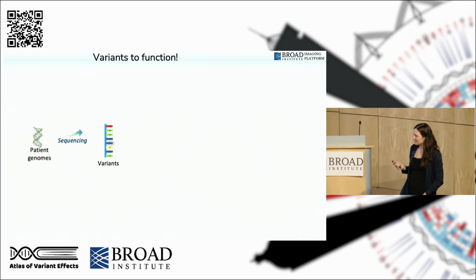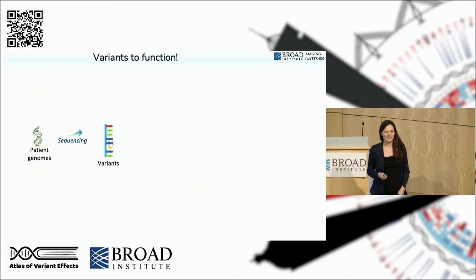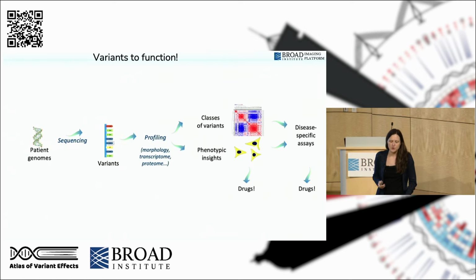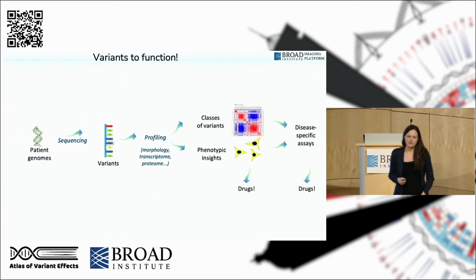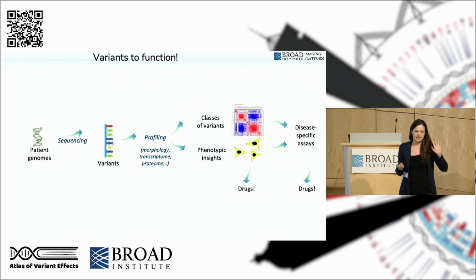So first of all, this is where a lot of us are really focused, that we care about the fact that there are many, many more sequencings, many, many more variants in our databases these days, and they all need characterizing. And so, of course, it's really awesome if you can make some kind of an assay to analyze, for a single gene, tons of variants at once, and we've seen some awesome examples of that.